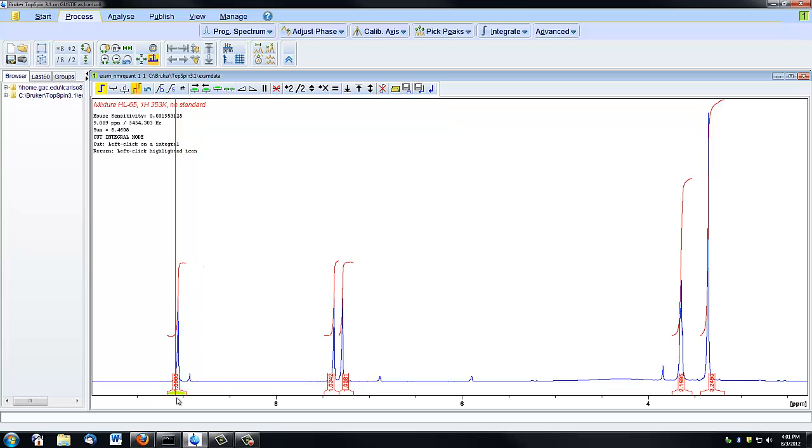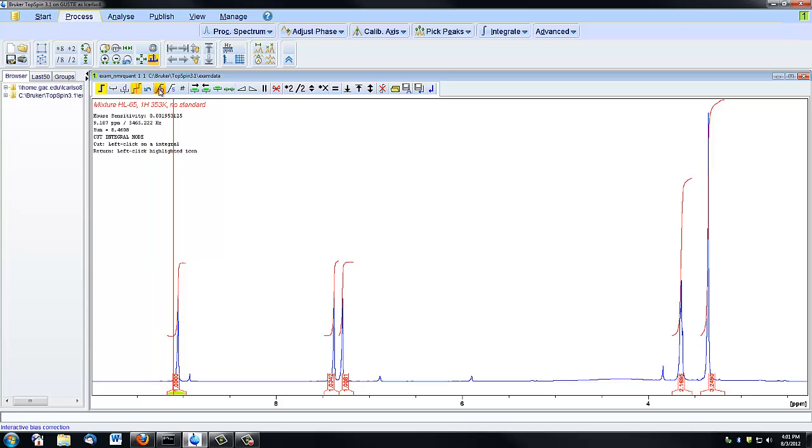So if I have this integral selected, and then I click on this bias correction icon and click and drag up and down, you can see that the lines are changing. And the same thing happens with the slope.